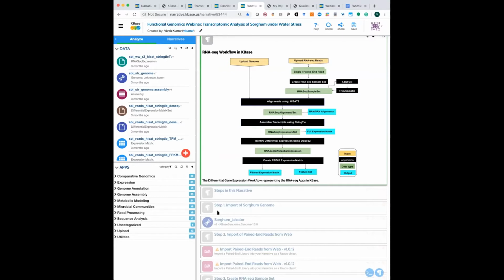And then you can embed the apps which generate that result. So basically what you have is really a close approximation to a publication, except that it happens to be a live publication which you can update at any given time by updating the data as well as updating the apps. Okay.